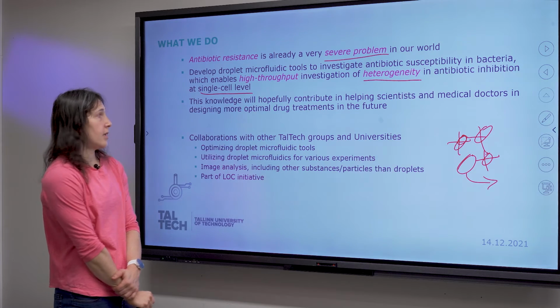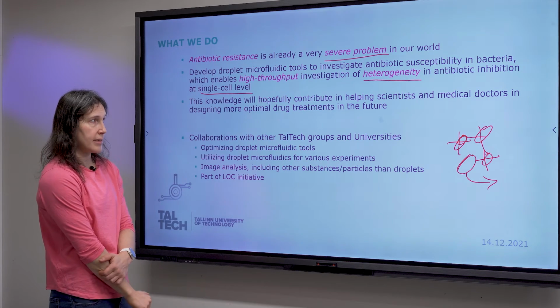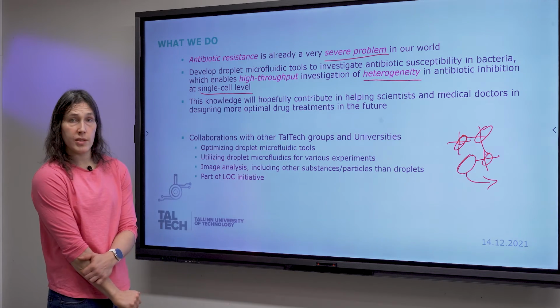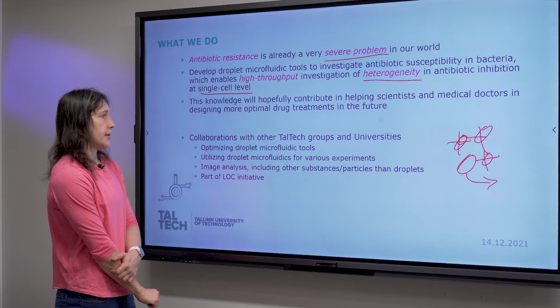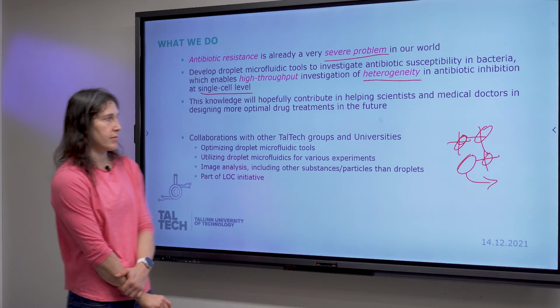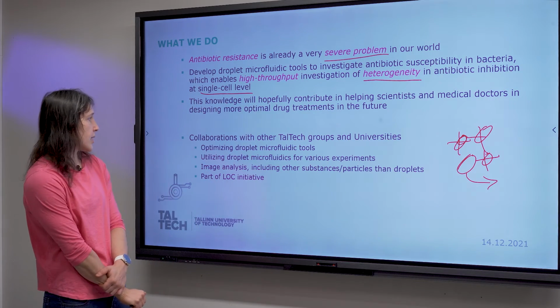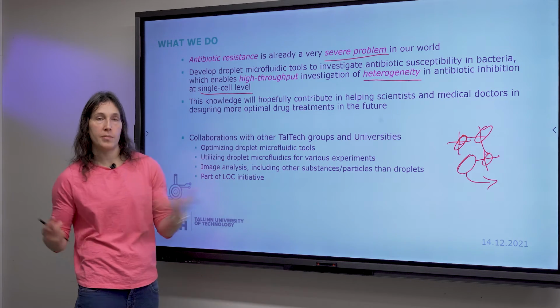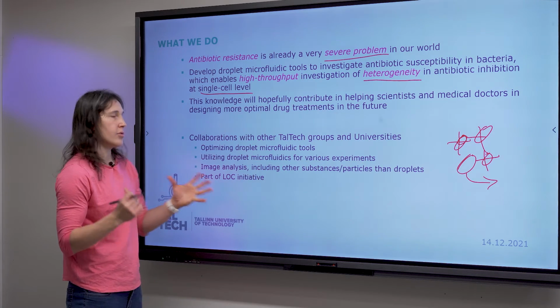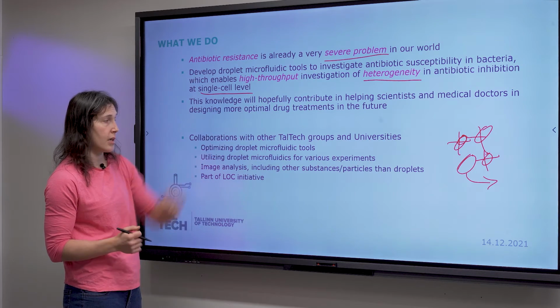And hopefully the knowledge that we find will help scientists and medical doctors in designing more optimal drug treatment in the future. But we also have collaborations with other groups at TalTech and other universities. We help optimizing different droplet microfluidic tools, how to utilize droplet microfluidics for different experiments, not just ours.